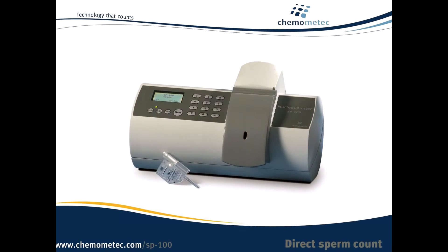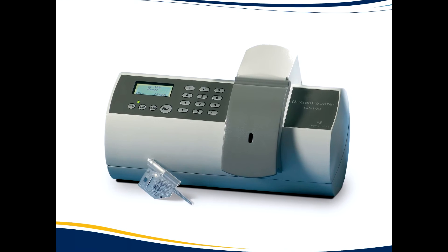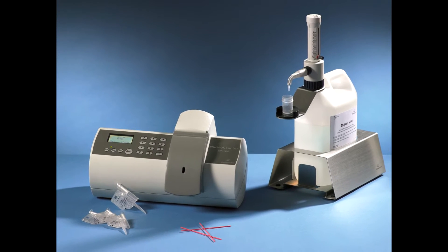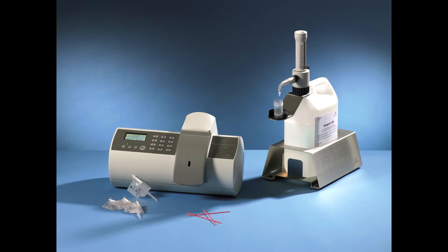The Nuclear Counter SP100 works equally well with ejaculates and extended doses, even when the extender contains milk or egg yolk. Due to the difference in sperm cell concentration in ejaculates compared to extended doses, the two are counted using different dilution factors.